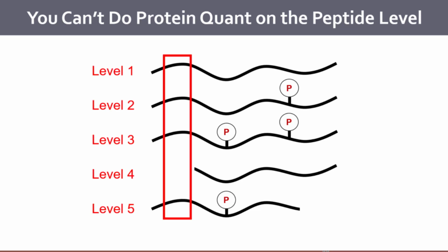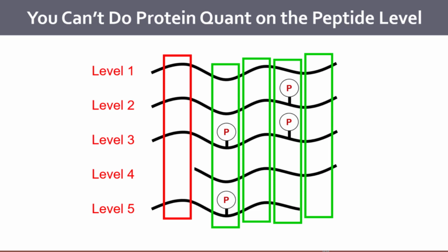So if you're making a measurement on the peptide level, it's going to be the weighted average of the different forms that peptide is present in. And of course, they would all potentially be moving in different directions, and they should be moving in different directions. In fact, there are enormous cases, especially when you look at human proteins, where the peptides are moving in different directions across different conditions, right? We see this time and time again in different experiments. Every time we look deeply at it, we tend to see that. So I wanted to bring up a couple of experiments that have been going on in the lab in the last couple of weeks, which just highlight some of this.